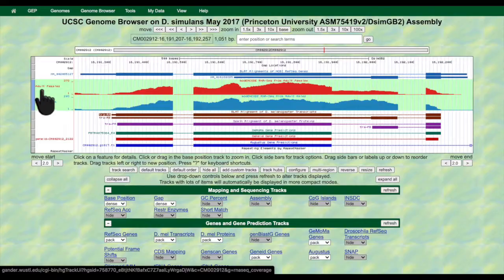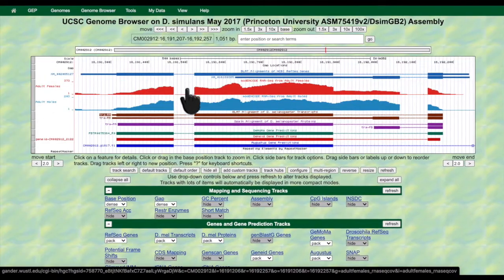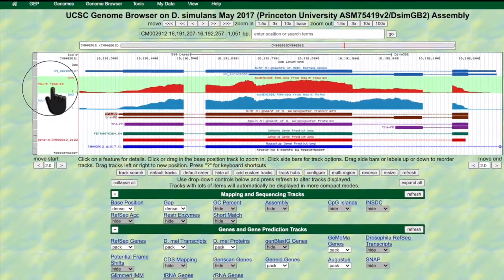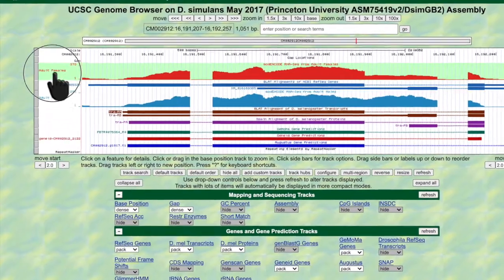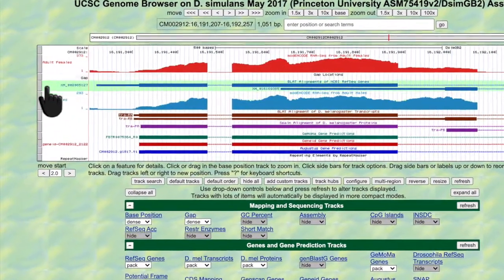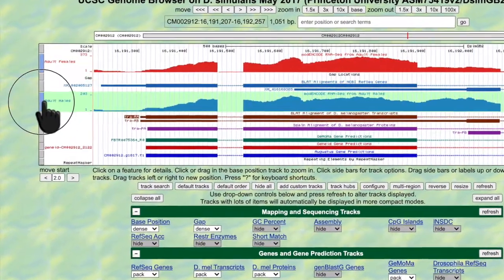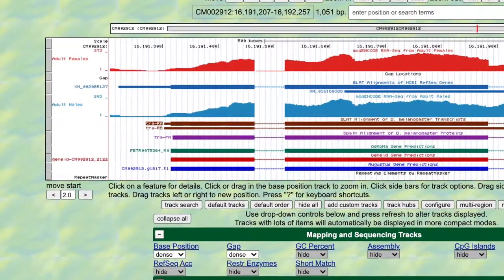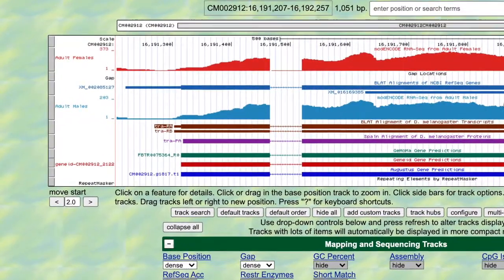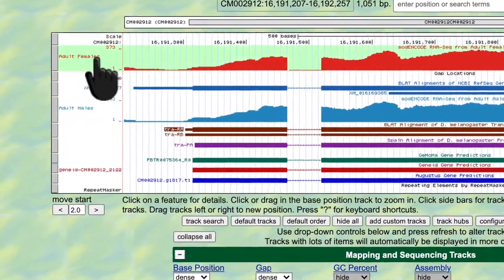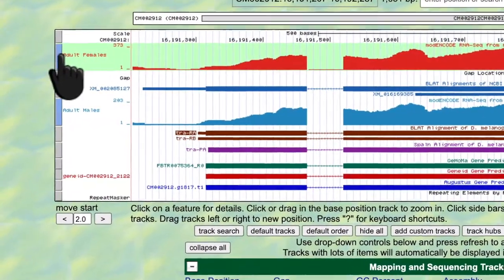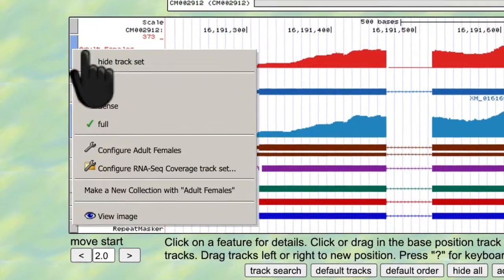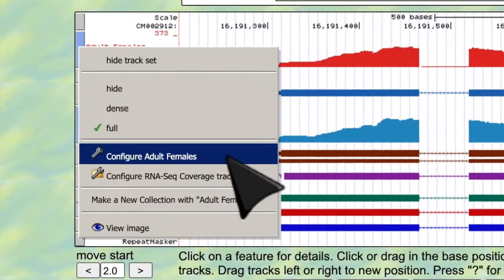Now that we have some context, let's go back to the UCSC Genome Browser for our example target species and gene, D. simulans' transformer gene. I'm going to go over some ways that we can configure the RNA-seq tracks to our advantage. We can either configure each individual track, or we can do this for all of them — I'm going to do it for all of them for this example.